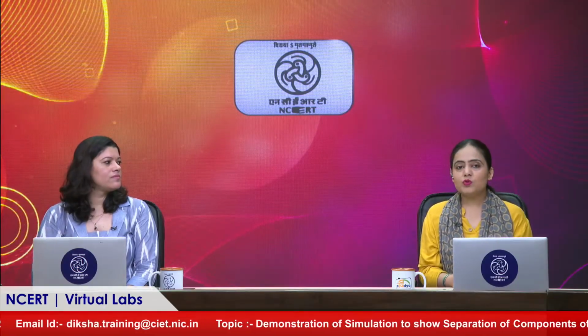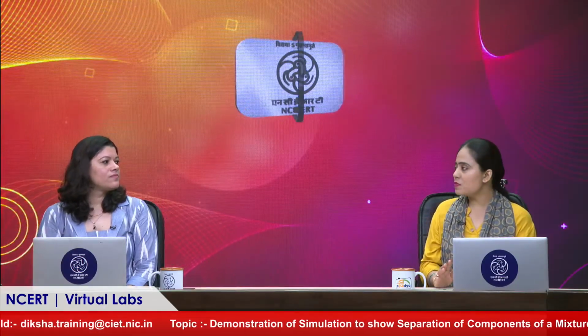And I think the best part is when you perform a simulation in a virtual lab, then when you go to the physical laboratories, you don't spend that much time just rehearsing. I mean, you're really quick because you know what steps to follow, and you can accurately get the desired results. That is one major benefit, I think, that we get from these virtual labs.